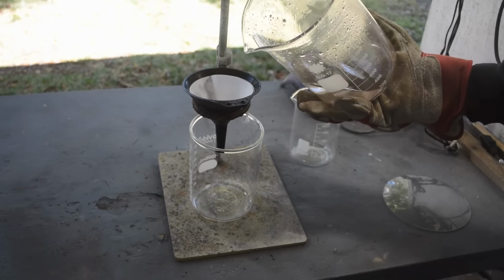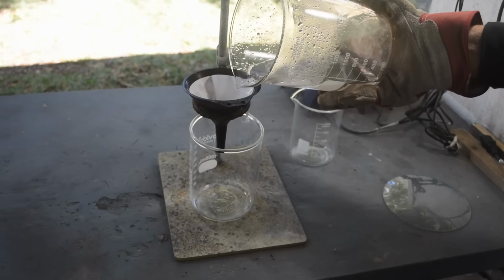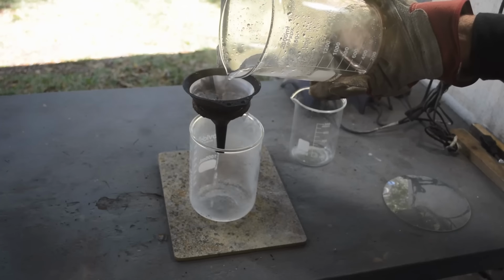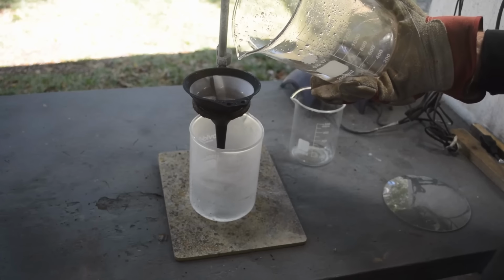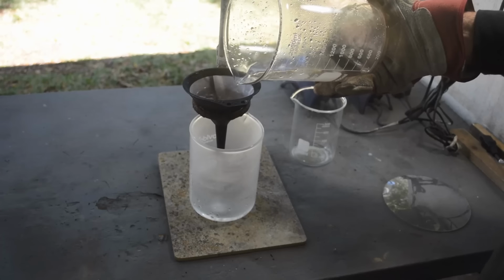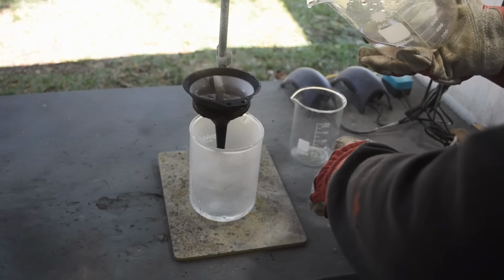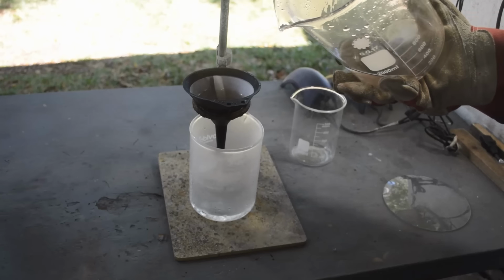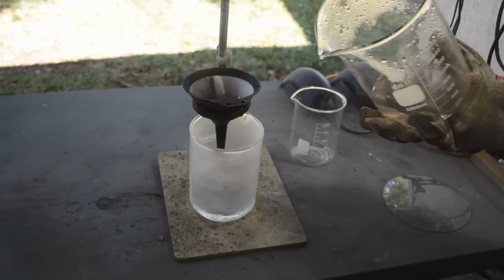So, okay, I'm going to filter this because there is still a little gold in the water column. So I'm going to run this liquid through a filter here and capture all that. And I'll probably put this first water that comes off in my temporary stock pot too. And then I will transfer the gold powder in the bottom of this beaker into a smaller beaker. And we'll go back into the fume hood for further treatments. All right, it's going to take a while to get it all through this little bitty filter.